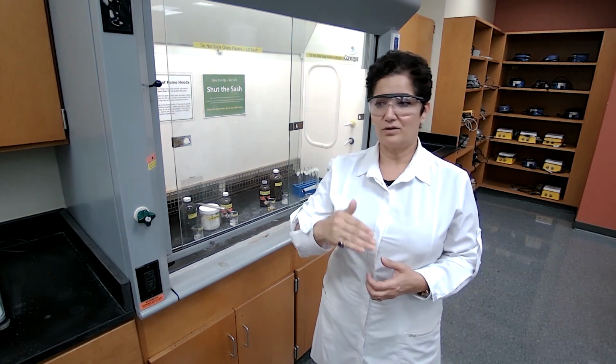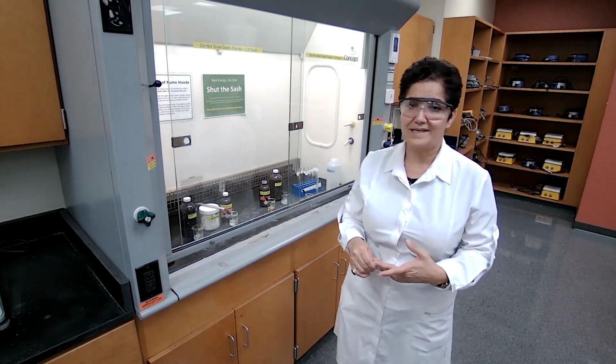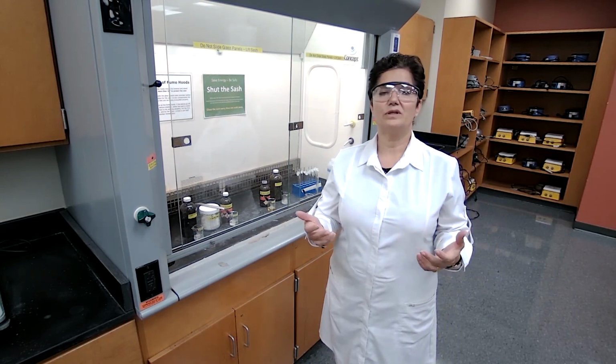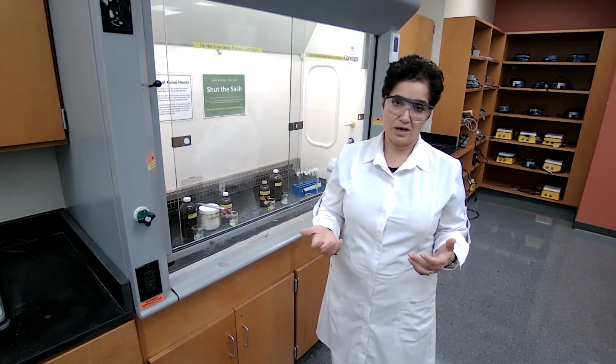So the trend, the steps that we follow in testing solubility: first, we test solubility in water, then solubility in hydrochloric acid. In 5% hydrochloric acid, the only compound that would dissolve is going to be a basic compound.